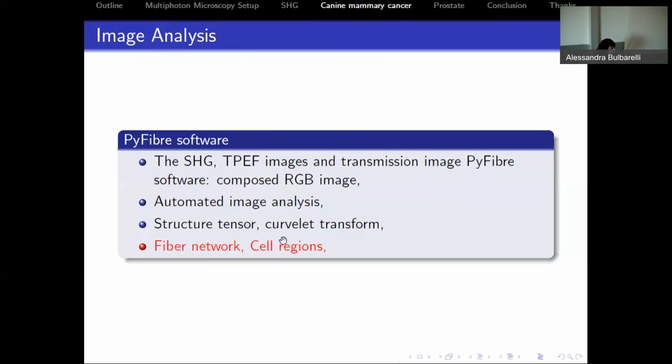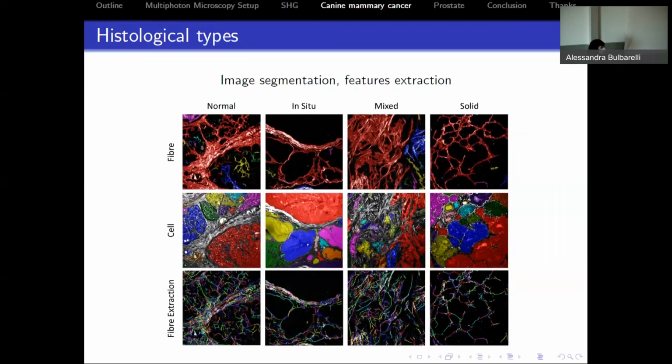And so we used some image analysis techniques that transform that image into a tensor. With that, we can calculate intensities and many details of the processes at each point of the image. So what we can get from the software is this idea.